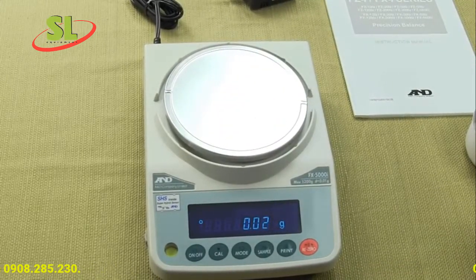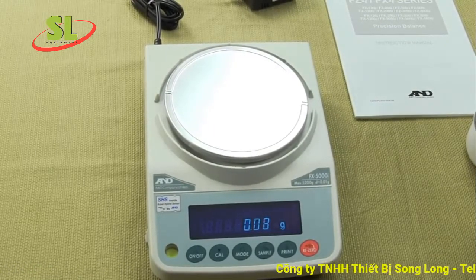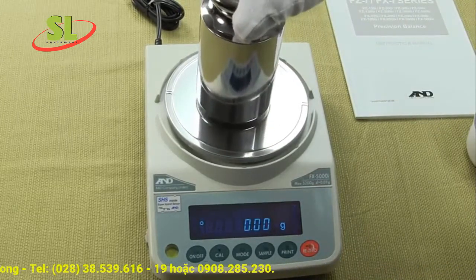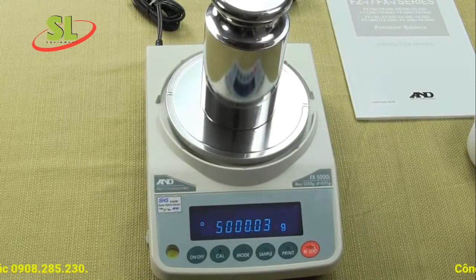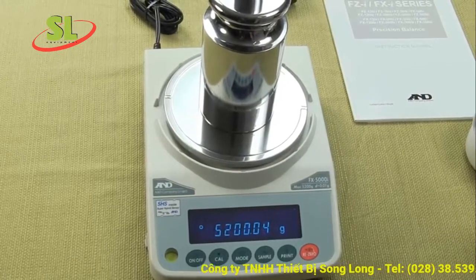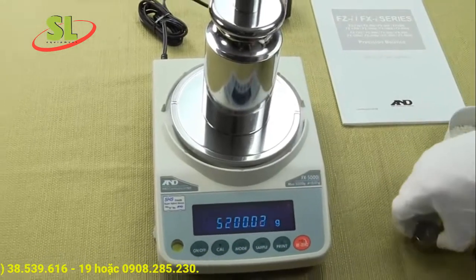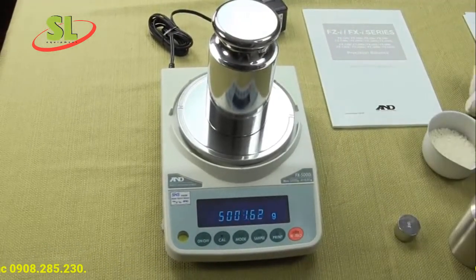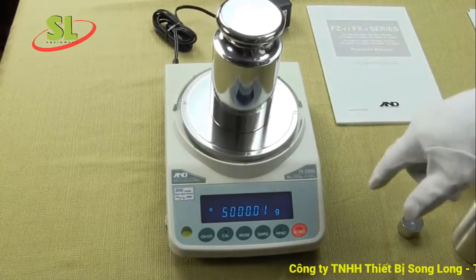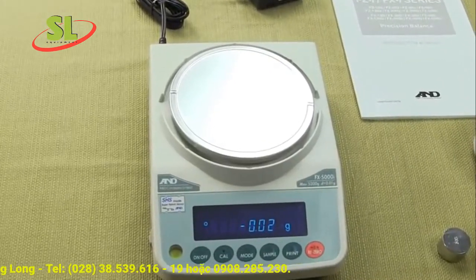This balance has a capacity of 5200 grams by a hundredth of a gram. If we put an excessive load on it — anything over that — you get an E overload display. This balance in particular can be calibrated with either a 3 kg, 2 kg, 1 kg, or 500 gram weight. The default is 5000 grams.